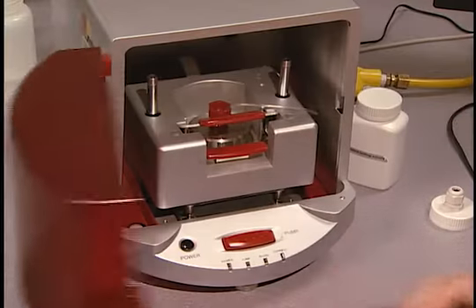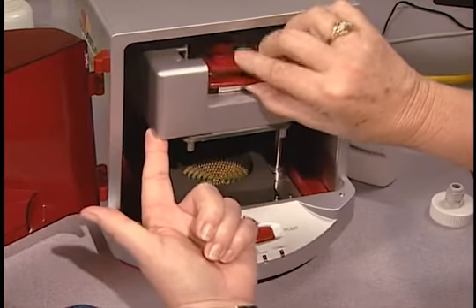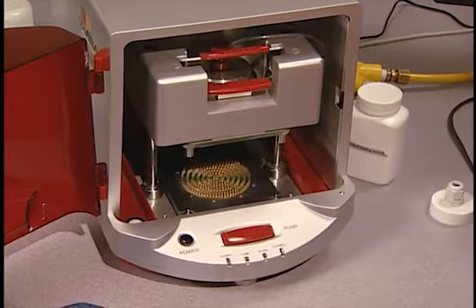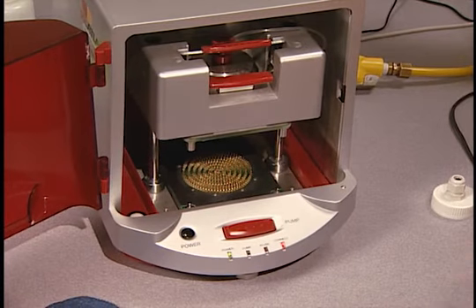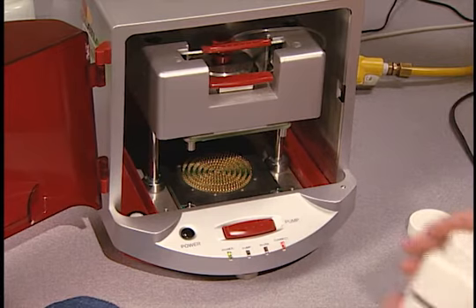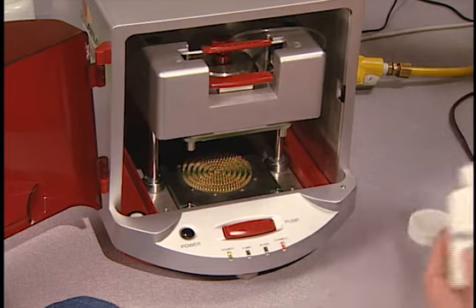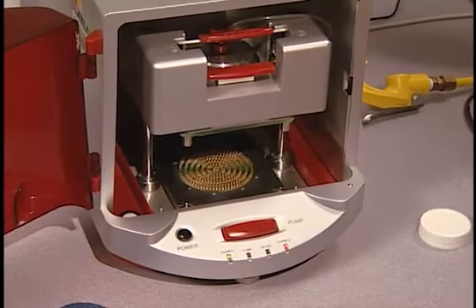Test Method 195 uses an instrument, appropriately called a moisture management tester, which has an upper and lower sensor field, each with seven concentric rings. It measures movement and content of liquid as it moves through and along fabric specimen surfaces. Several aspects of the test method procedure lead to the understanding of the test results.